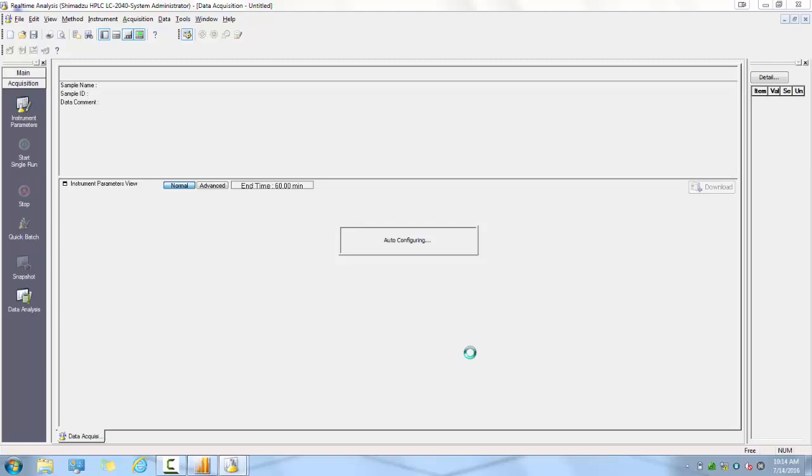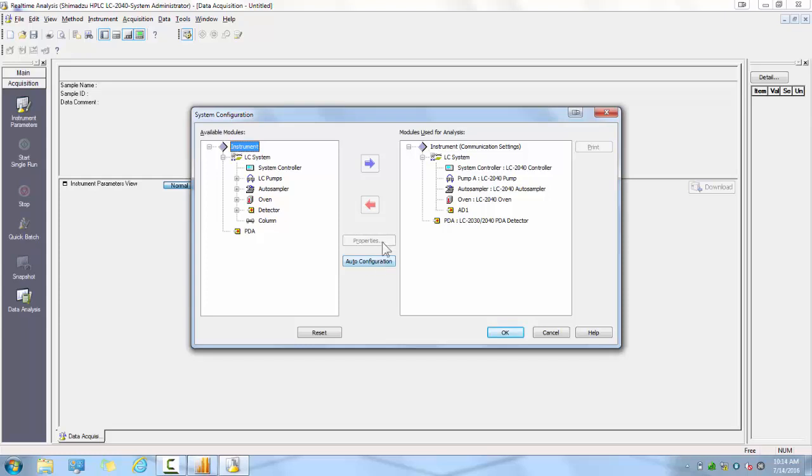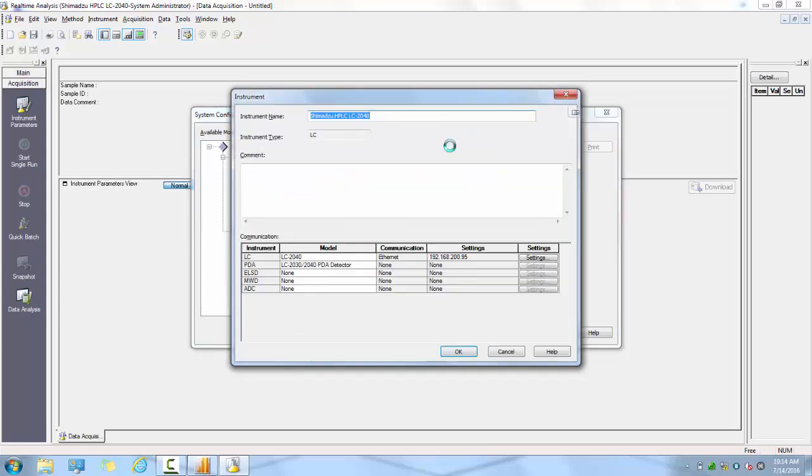Your system hardware configuration should be shown on the right side of the column. If not, click on the auto-configure button to have your system identify what hardware components are in your system. If you do not see your system components in the column, even after clicking the auto-configuration button, there is a problem with your system communication settings. You should never have to manually add a module to your system configuration. You can always return to adjust your instrument communication settings by double-clicking on the instrument communication settings at the top.